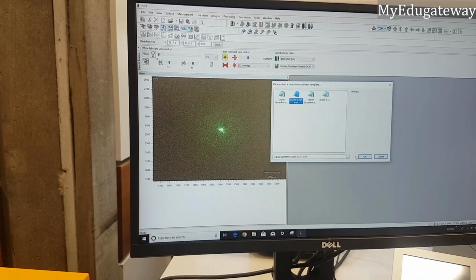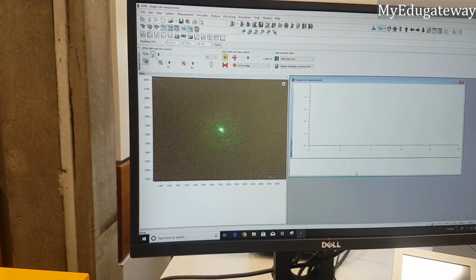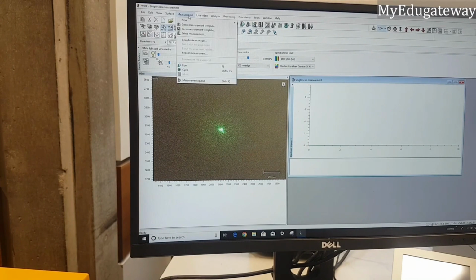And then you open, you okay it. Then select the measurement template and then you run.